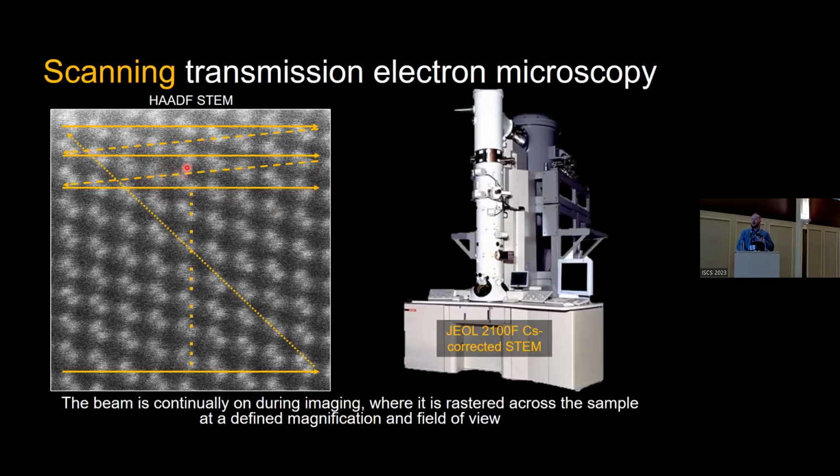Now, these images are being continually formed. The beam is always on when we're doing images. We can blank the beam, but generally speaking, in usual operation the electron beam is always exposing the sample. We're always collecting scattering data. So as previously asked in one of the questions, you're just assuming you know where the probe is. And if the microscope's doing its job right, it should be where the pixel in the scan coordinates says it is, and you form an image with information at that location.